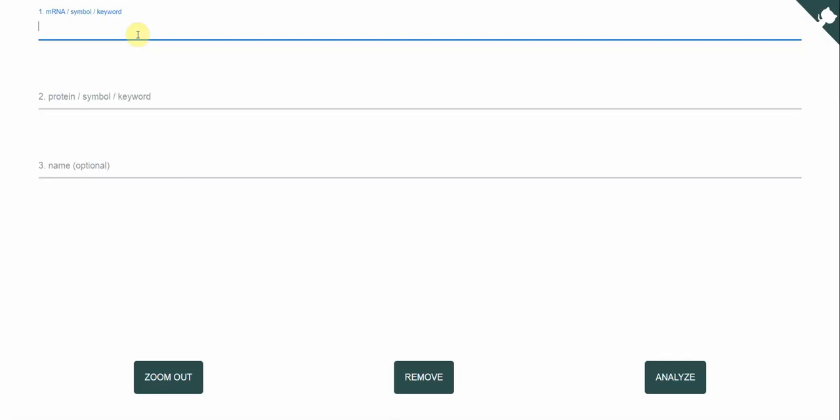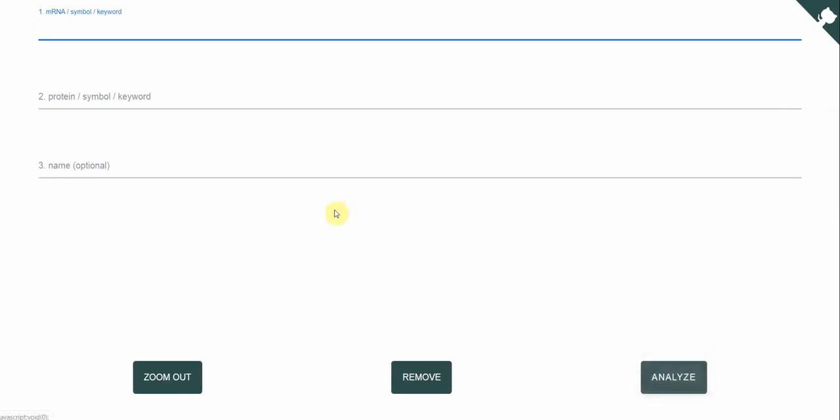It doesn't matter where you get them, either from UCSC, from Ensemble or NCBI. And then you can just click the Analyze button without using any keywords.